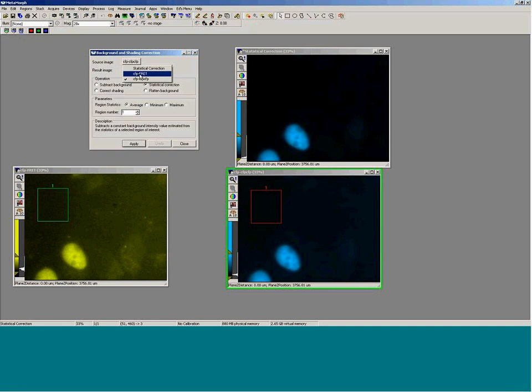If we measure the average intensity within each of these images and log them out to Excel, we end up with something along this line. From the background subtracted images, we end up with a certain value, and the average of the ratios happens to be about 0.5938.